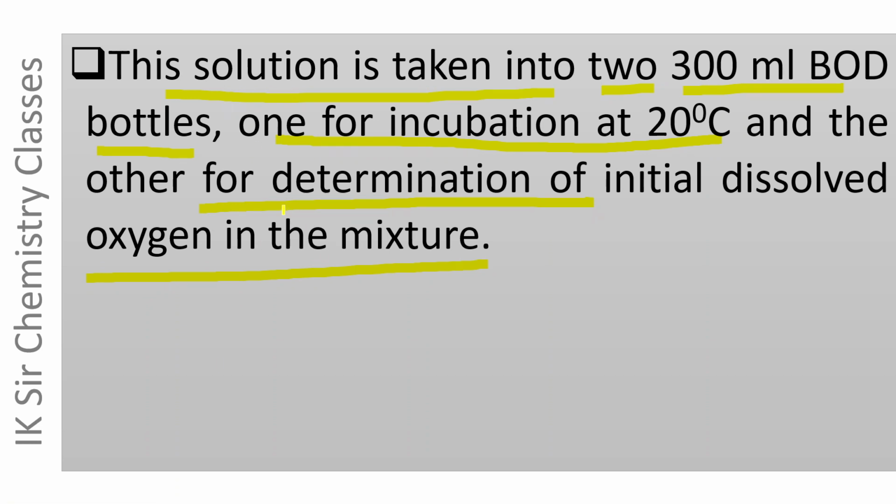This diluted water sample containing nutrients for microbes is taken in two 300 ml BOD bottles.